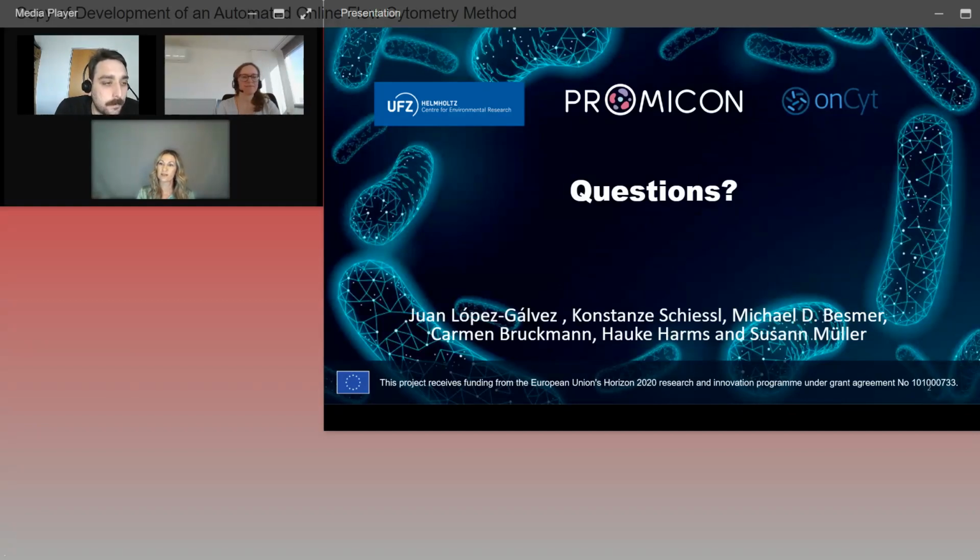Now, Juan, Konstanze, have you tried more complex communities? For this procedure, not, because we only validated this procedure. We only want to standardize this procedure. It is the proof of concept that this DAPI staining can be done online and automated by the OC300. So in the case of this procedure, we have only used this small community that we presented.